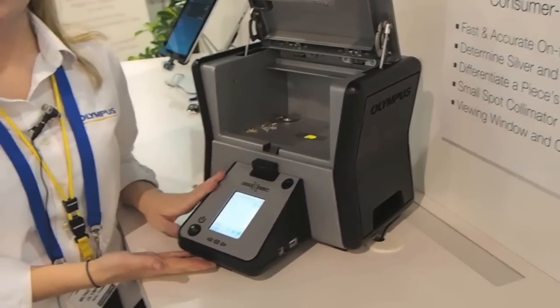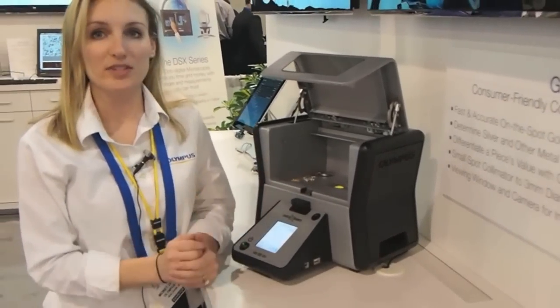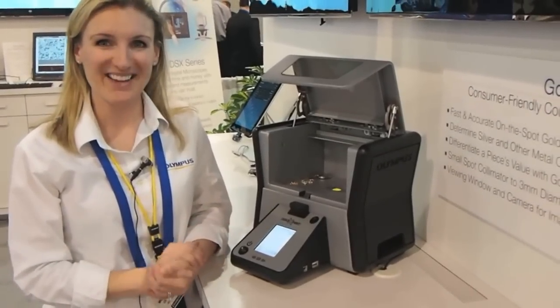We're also able to hook this instrument up to a printer so that folks can print out the results and hand it to their customers, so that they have a test report of what the instrument was able to analyze on their samples.